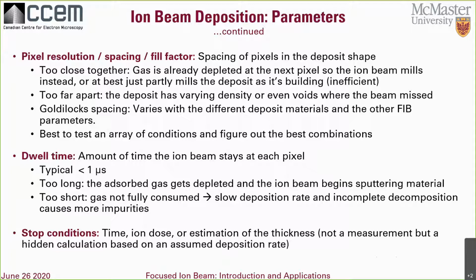So there are other strategies to thin samples without actually having to lift them with a manipulator, and those are typically going to work better for cryo. For biology samples, I think that's what's typically done: they start with a cell or whatever the feature is on a TEM grid itself, and then do a really low angle, nearly parallel to the grid, and make a lamella that way.